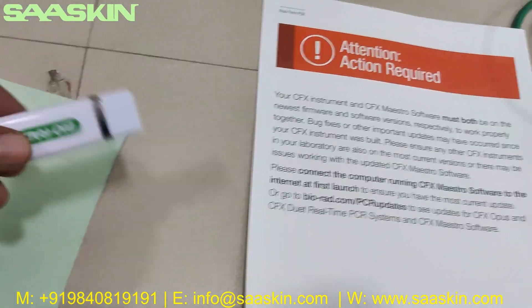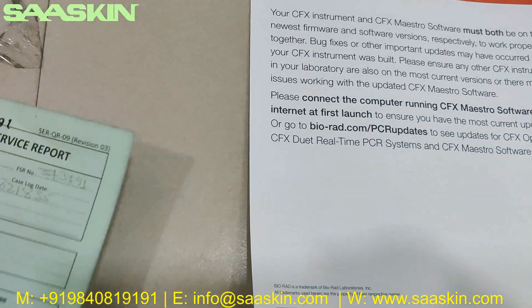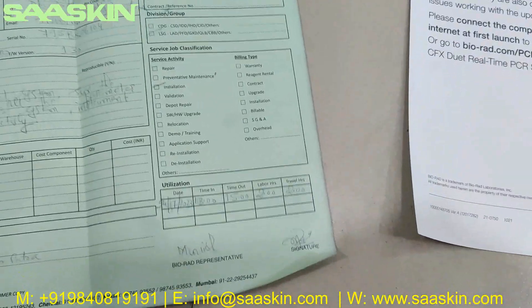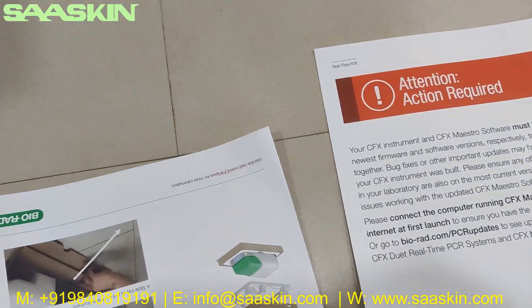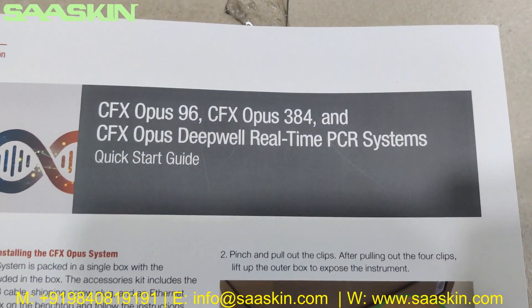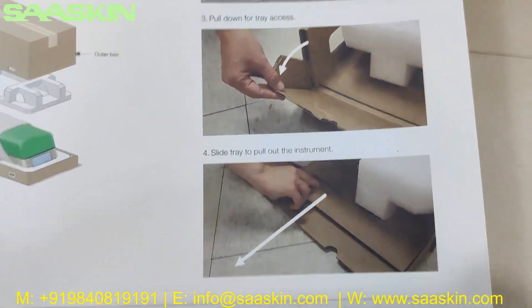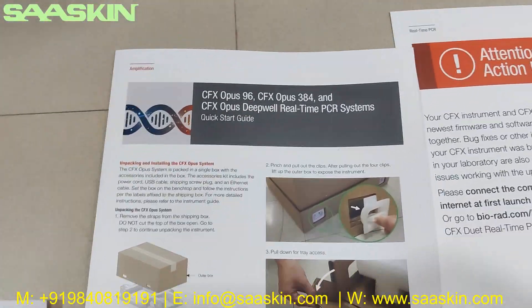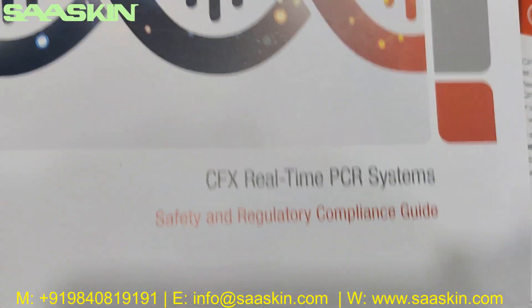There is also a pen drive included. You can also see inspection details, a CFX Opus 96 quick start guide, and a detailed CFX real-time PCR system safety and regulatory compliance guide.